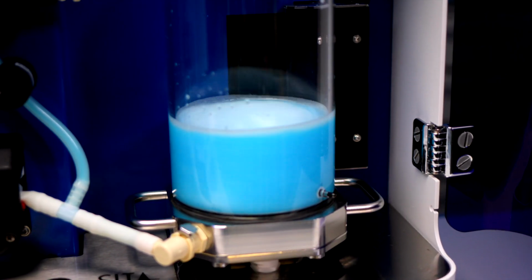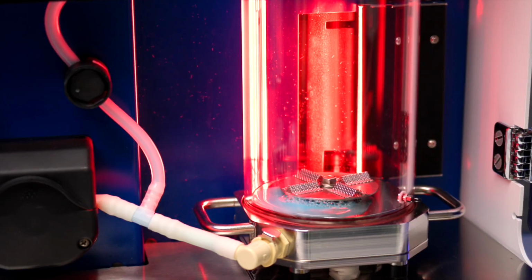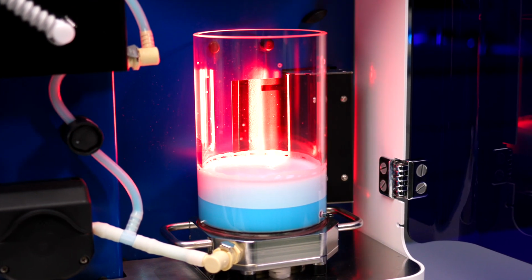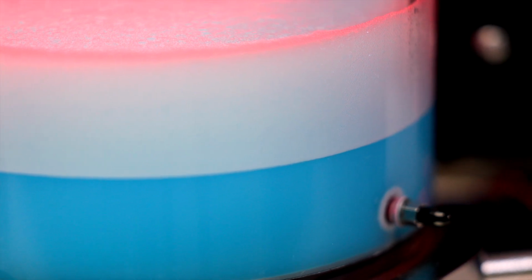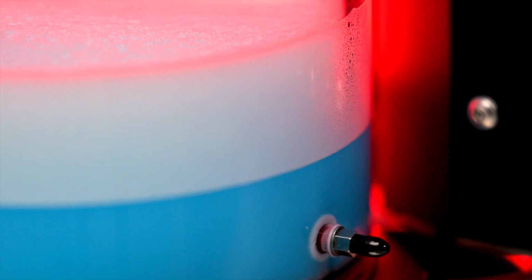The SITA FoamTester generates foam step by step with a specific steering disc. Innovative optical measurement methods determine the foam characteristics such as foam volume, stability and drainage. In addition, an image of the foam structure can be recorded at any time in order to evaluate the properties of all foam bubbles, such as size and shape.